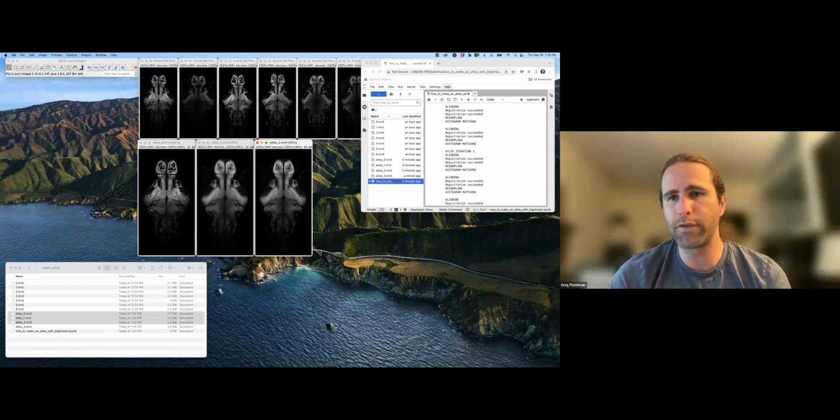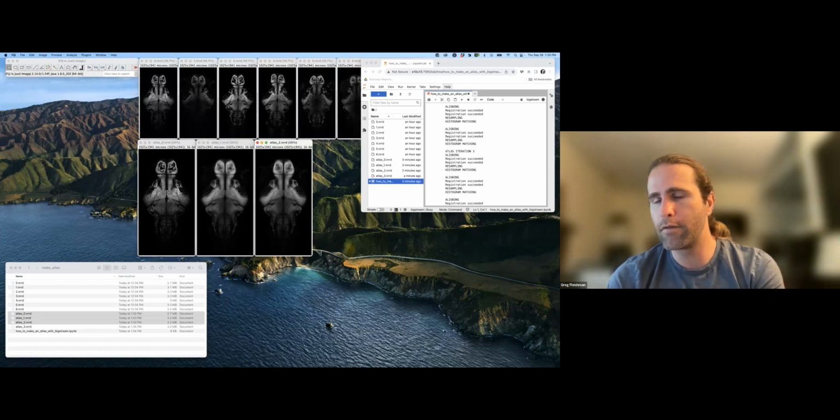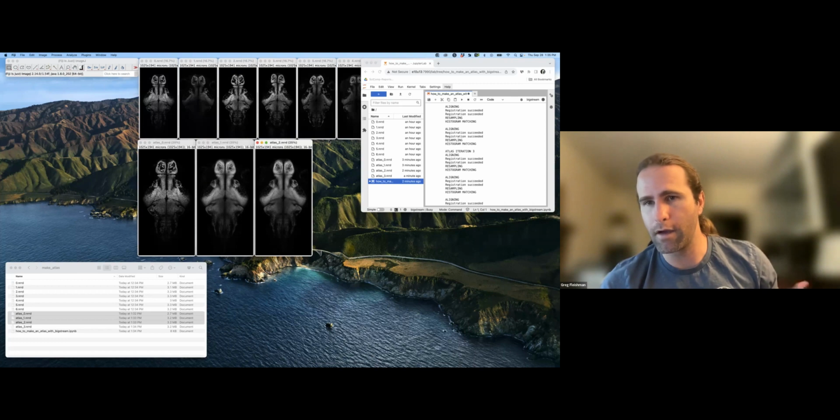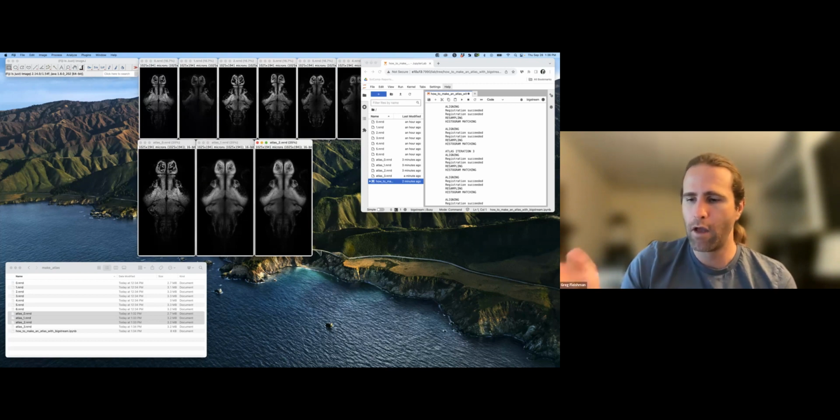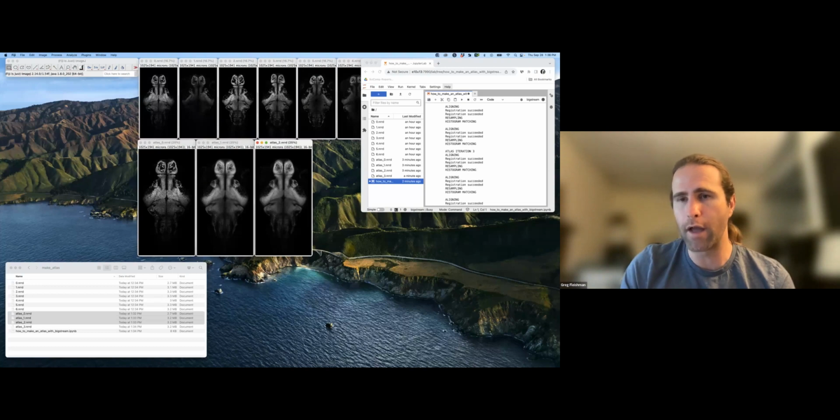Let's say you have multiple samples. The most common thing to do to integrate this with an experiment that you're doing is to make sure that for each sample you have at least one channel in common. So maybe you're collecting 3 different channels per subject. One of them stains all cells, and then the other 2 stain the things you're actually specifically interested in studying, like a subpopulation of neurons or only cells that are positive for a specific gene, or something like that.